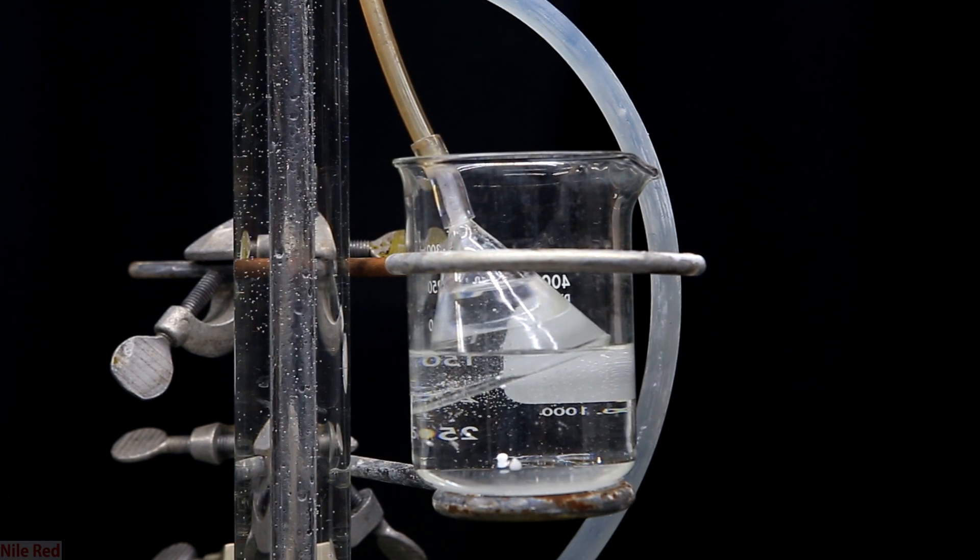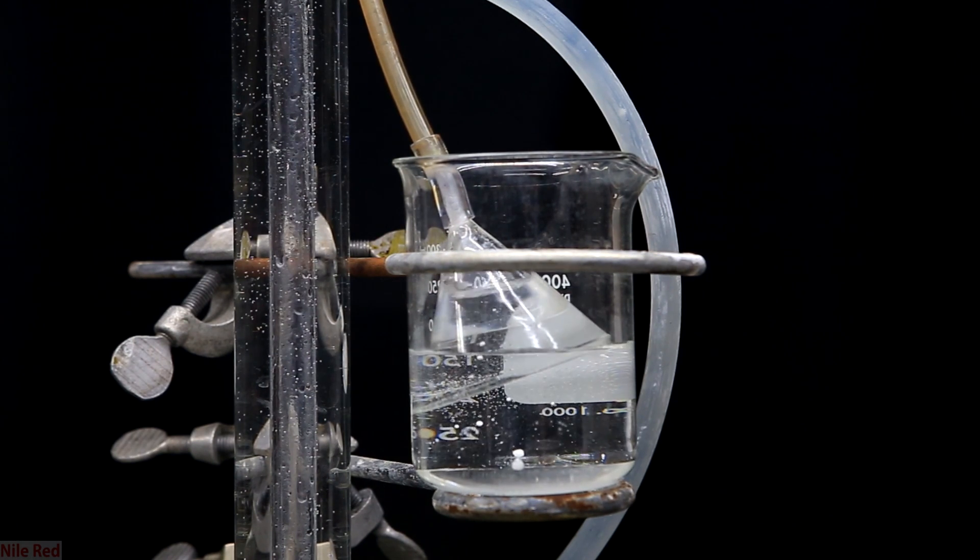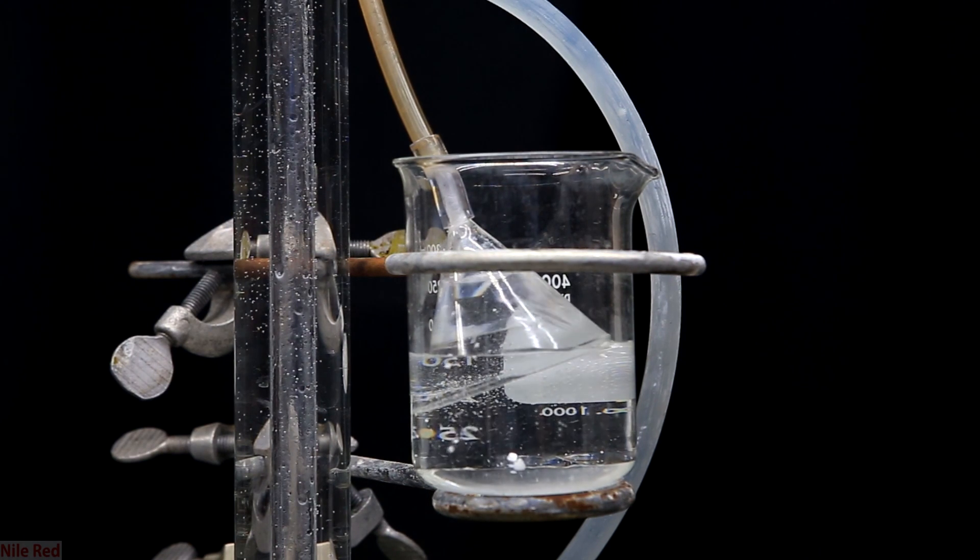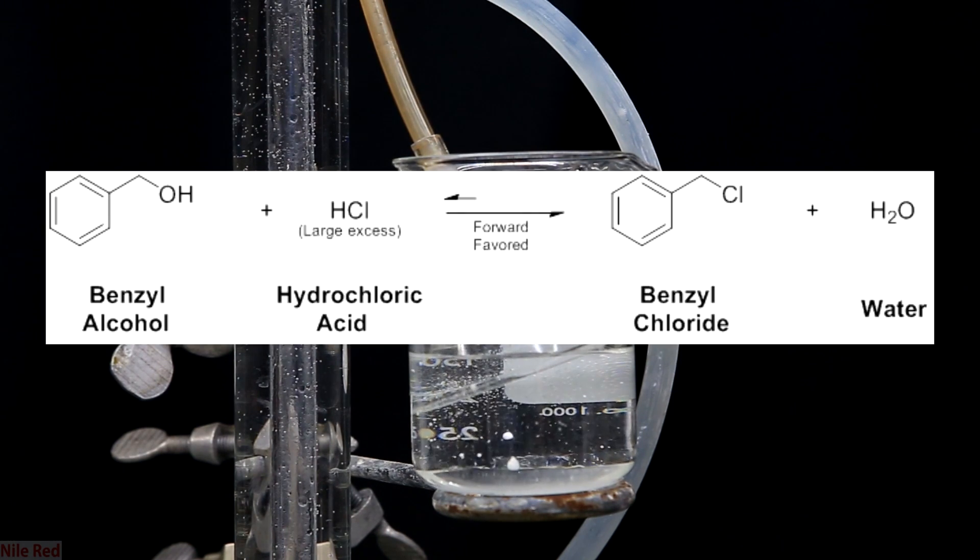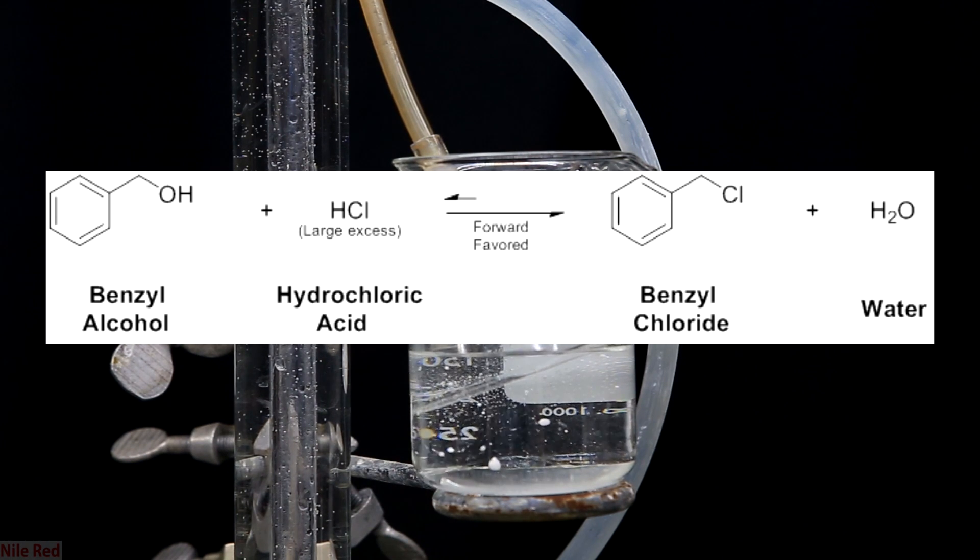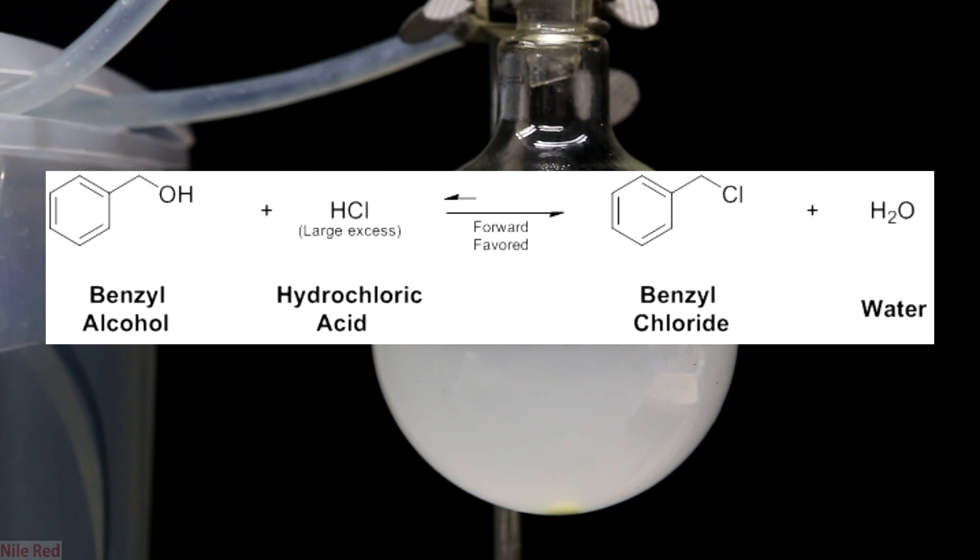There are several ways to make benzyl chloride but the easiest one is to start with benzyl alcohol. We then use hydrochloric acid to do a basic substitution reaction and swap the OH of the alcohol for the Cl in the hydrochloric acid. The benzyl alcohol is soluble but the benzyl chloride isn't so our product separates and then we isolate it. So that's the basic overview and now we can get started.